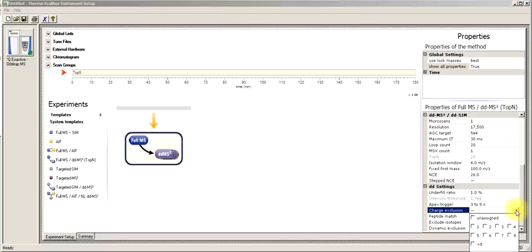Charge exclusion here is also upgraded from the LTQ and hybrid instruments. As always, we can say, if we can't assign the charge, don't fragment it. In most cases, we don't want to fragment our +1s. But unlike the hybrids, where we can only say up to 4, exclude those, we have the ability to control up through 8.